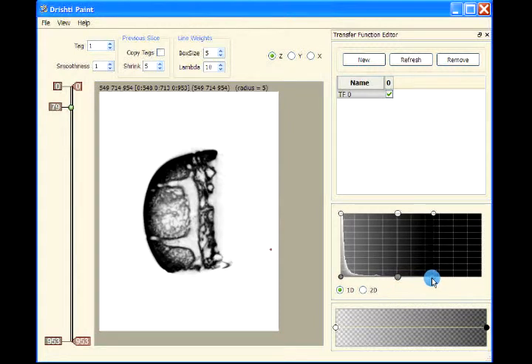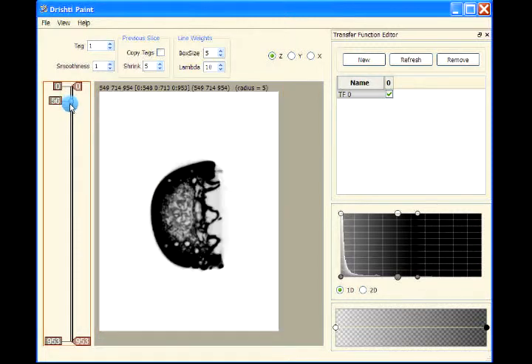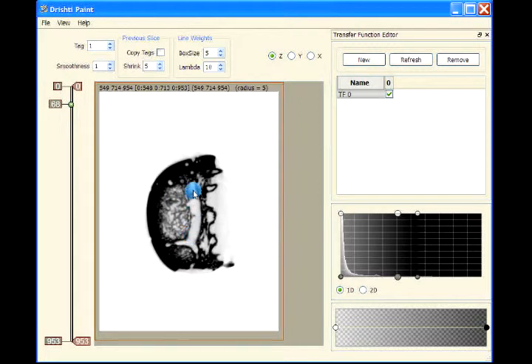and let's go up to this point here. Okay, so we can go right, so it's probably here, so let's mark this region.